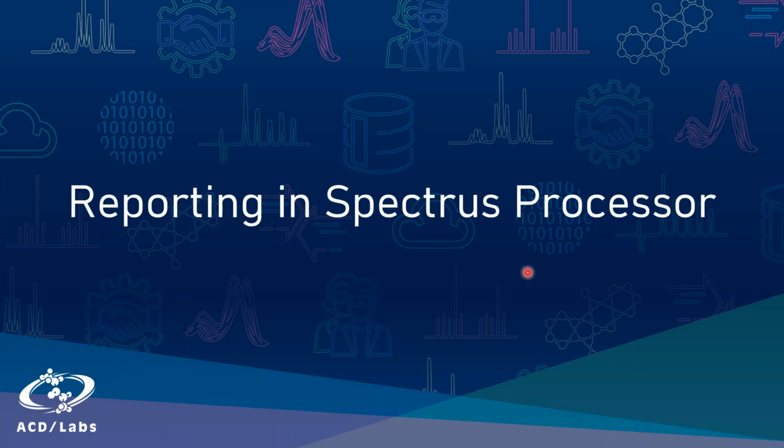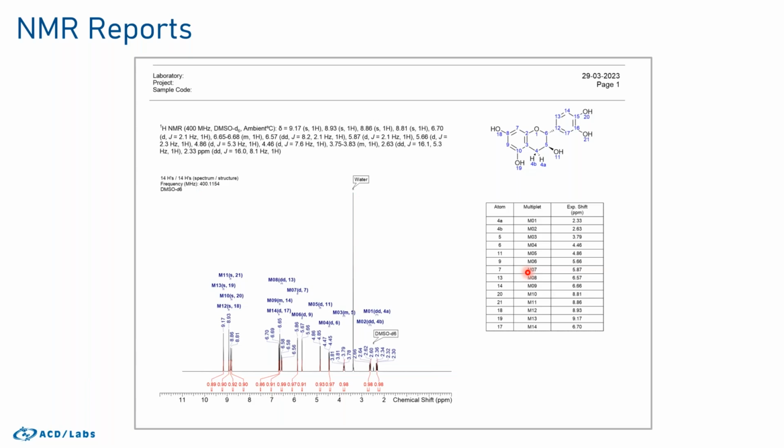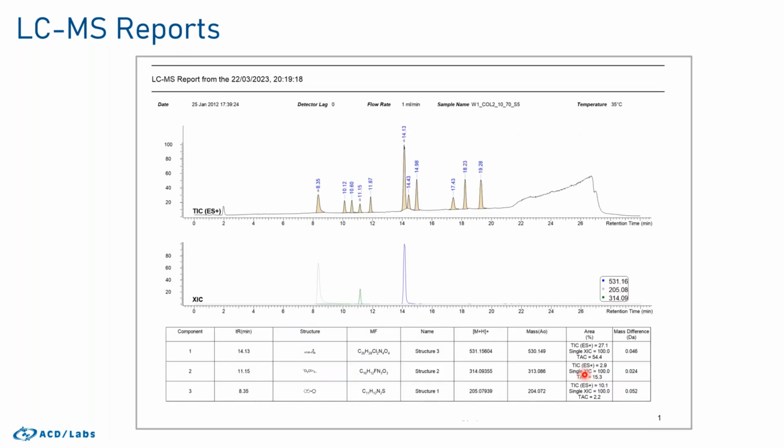Exactly, I don't have many slides, just two simple ones of what to expect from today's power lesson. I will walk you through how to generate standard reports, but also how to create reports from templates. That way you can generate nice NMR reports like that one shown here. We might have a header, a date, a structure, the spectrum, of course, and then some tables. Same for LC/MS. Those are the two techniques that we're covering. If you're working with GC/MS data frequently, it's quite similar to create reports as for LC/MS.